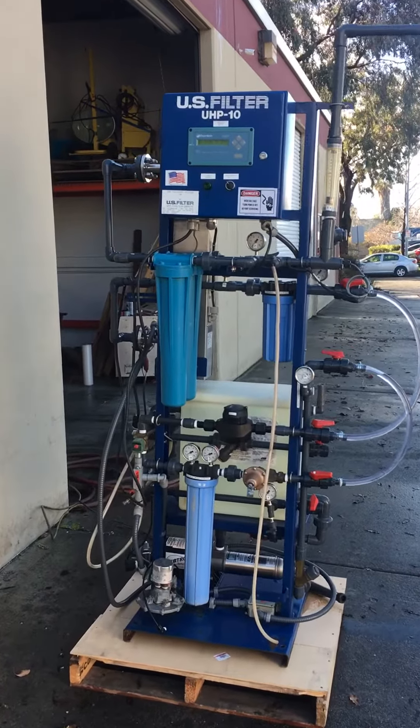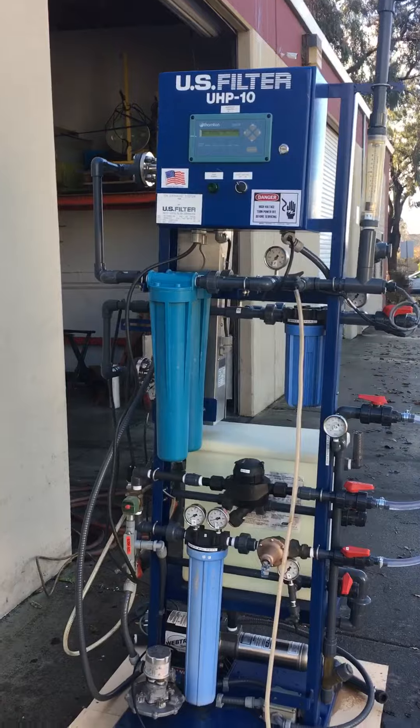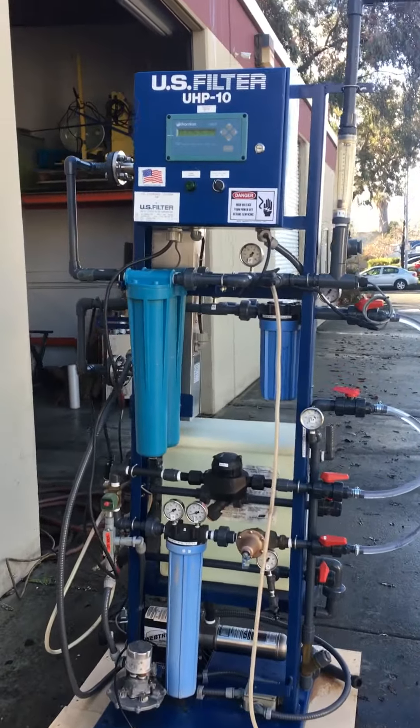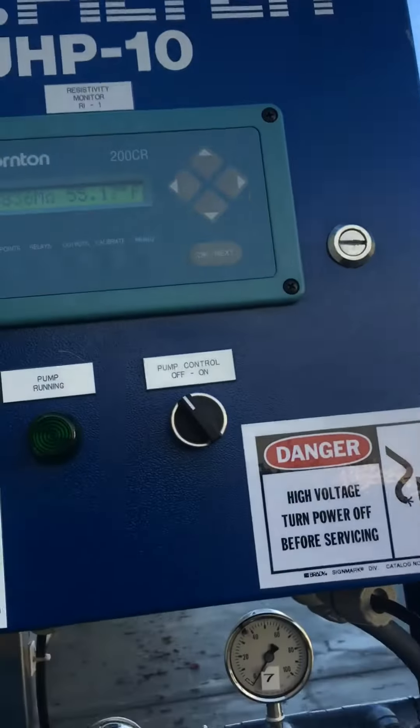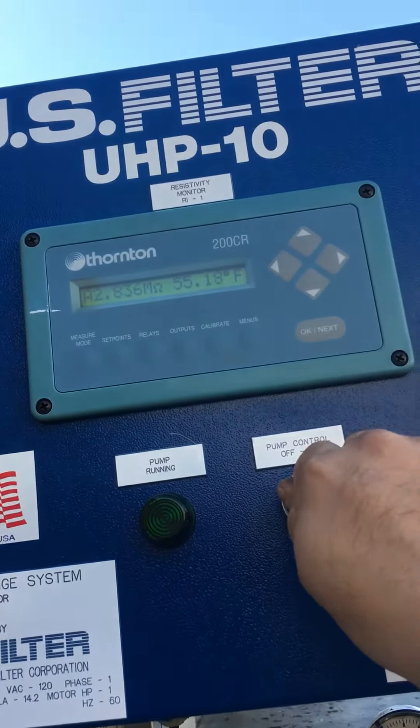Here we have a US filtered UHP 10 water filtration system. We're going to turn it on and show you that it works. It is hooked up to 115 volts, so we'll go ahead and hit the pump button here.